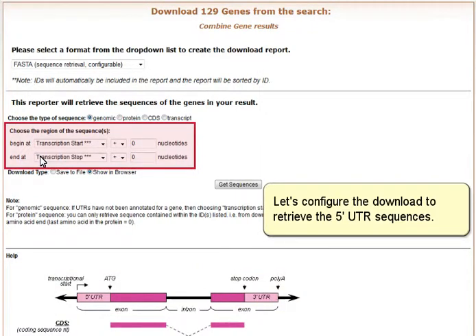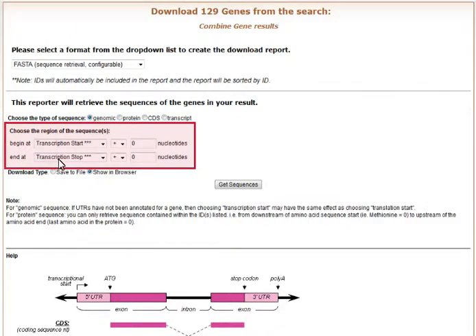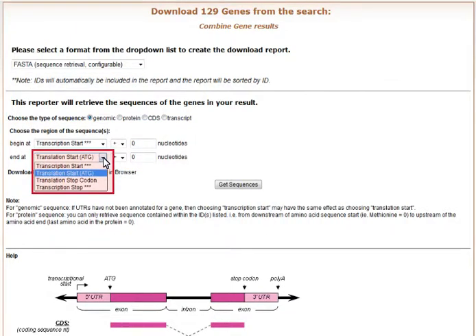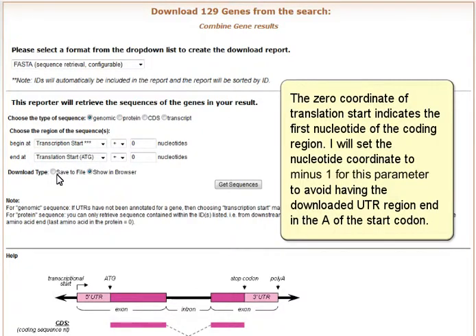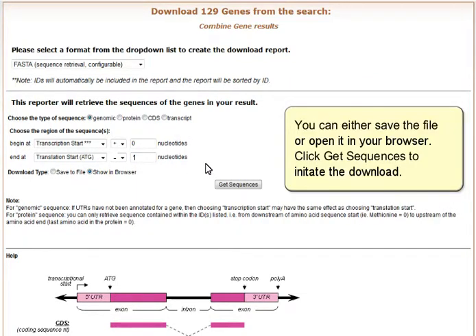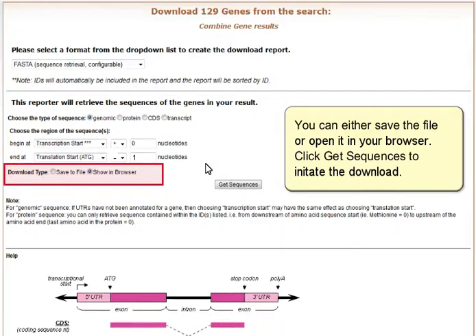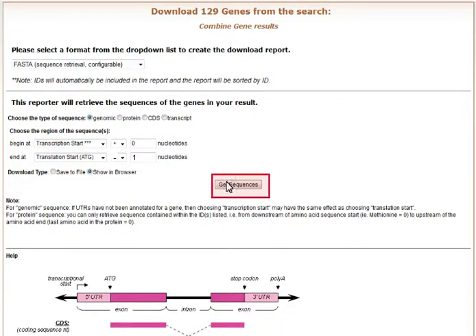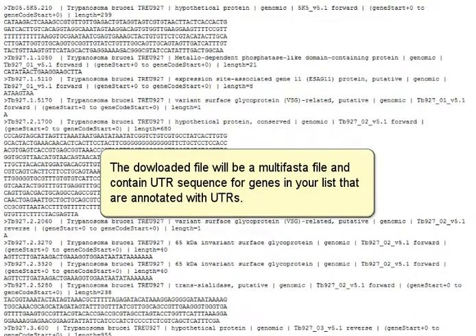Let's configure the download to retrieve the 5' UTR sequences. The zero coordinate of translation start indicates the first nucleotide of the coding region. I will set the nucleotide coordinate to minus 1 for this parameter to avoid having the downloaded UTR region end in the A of the start codon. You can either save the file or open it in your browser. Click Get sequences to initiate the download. The downloaded file will be a multi-FASTA file and contain UTR sequence for genes in your list that are annotated with UTRs.